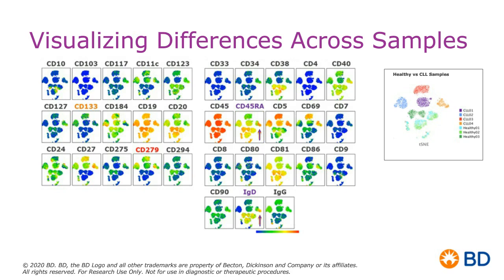And if I draw your eyes down 2 rows, to IgD, it looks like there are also, with the arrow pointing to the cluster, different levels of expression of IgD across this CLL sample. Again, a tremendous amount of information just by looking at different protein expression.